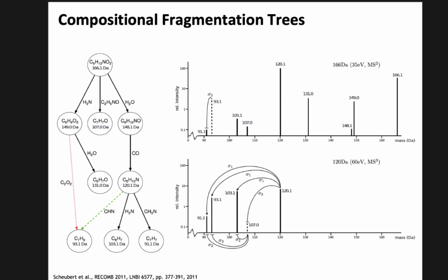then you can see what are all possible fragments that can arise from that. And if you see these peaks here, you know that this here is the mother fragment of all these other peaks. And that can help you to puzzle together your structure, possibly with auxiliary information that you have from NMR, for example, and really try to ensure that the spectrum that you see is consistent with the structure that you have. At this point, we're doing this only manually.